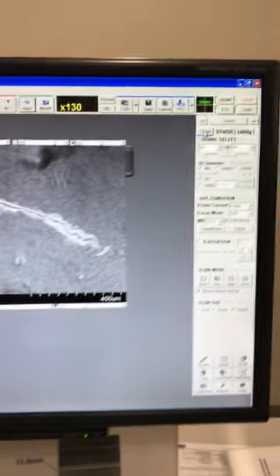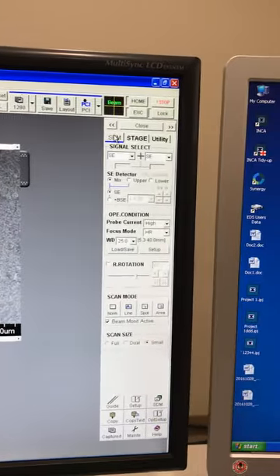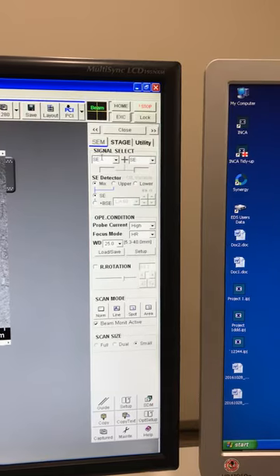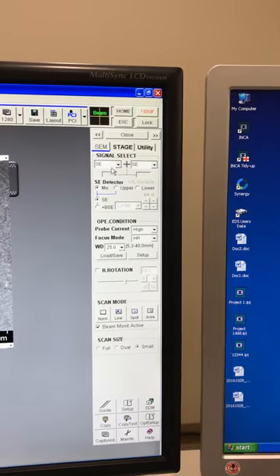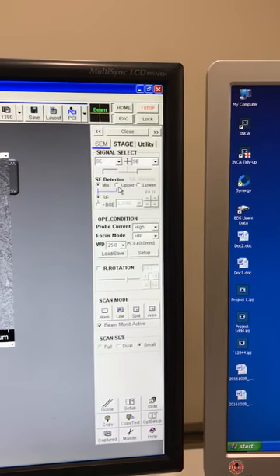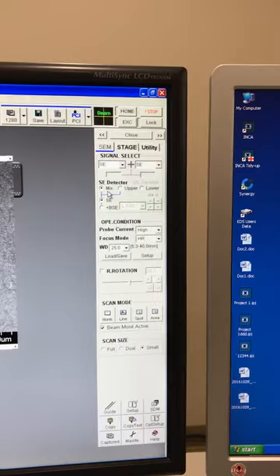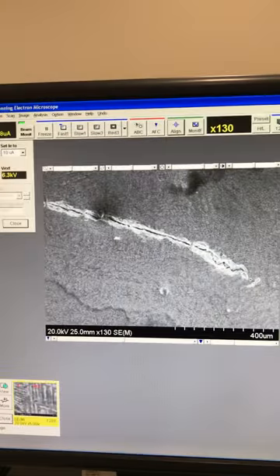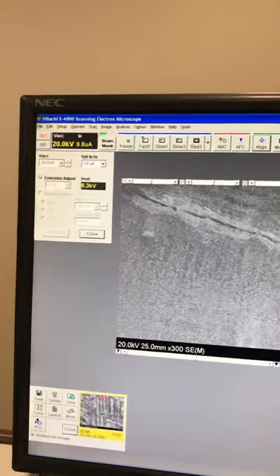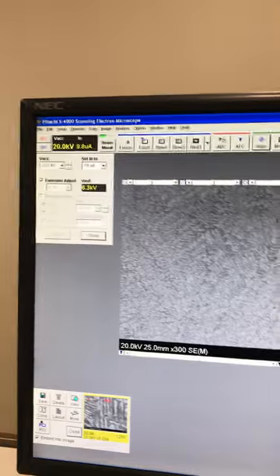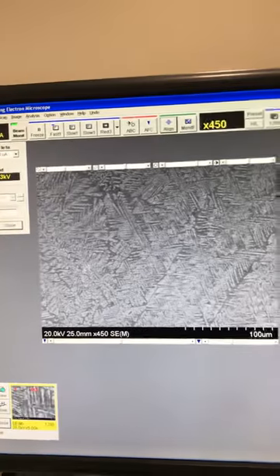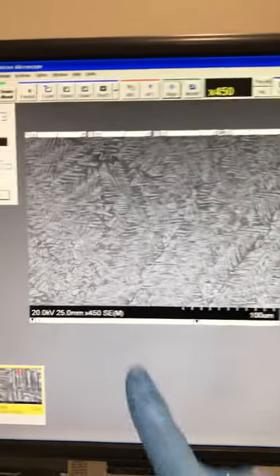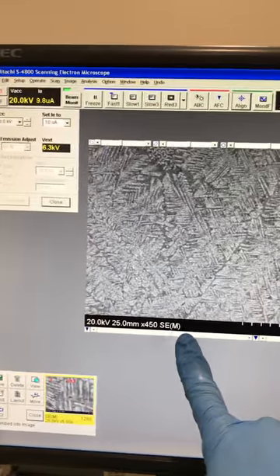So as you can see on the SEM tab, you have two secondary electrons selected. You have upper, lower and mixed. Right now, this image, I can increase my magnification. So this image is for secondary and it's mixed.